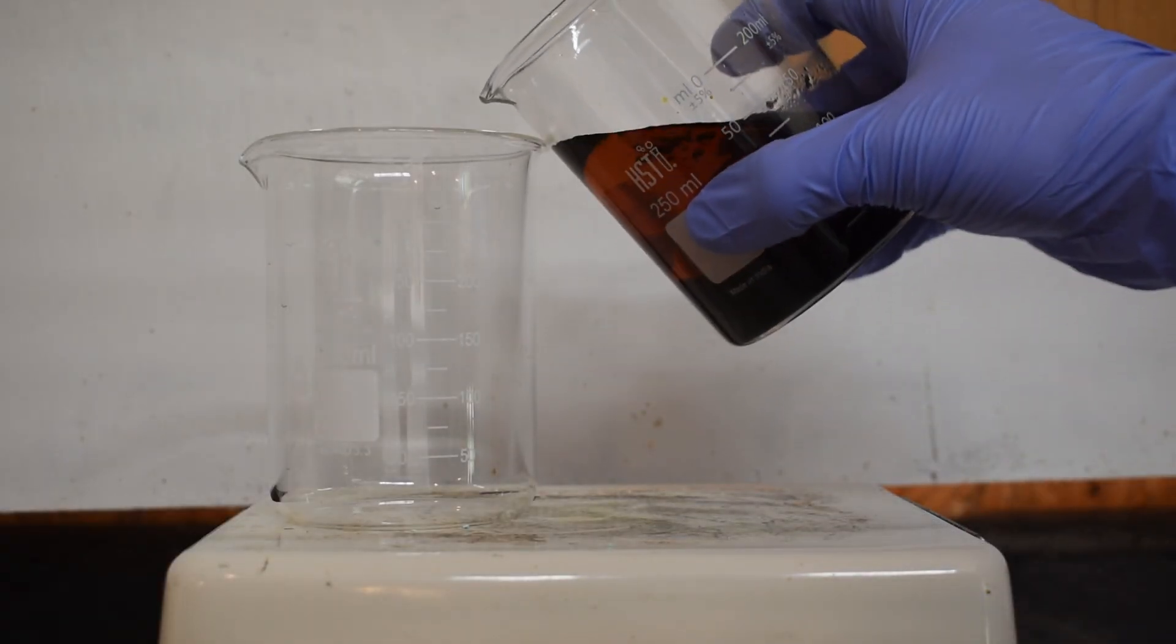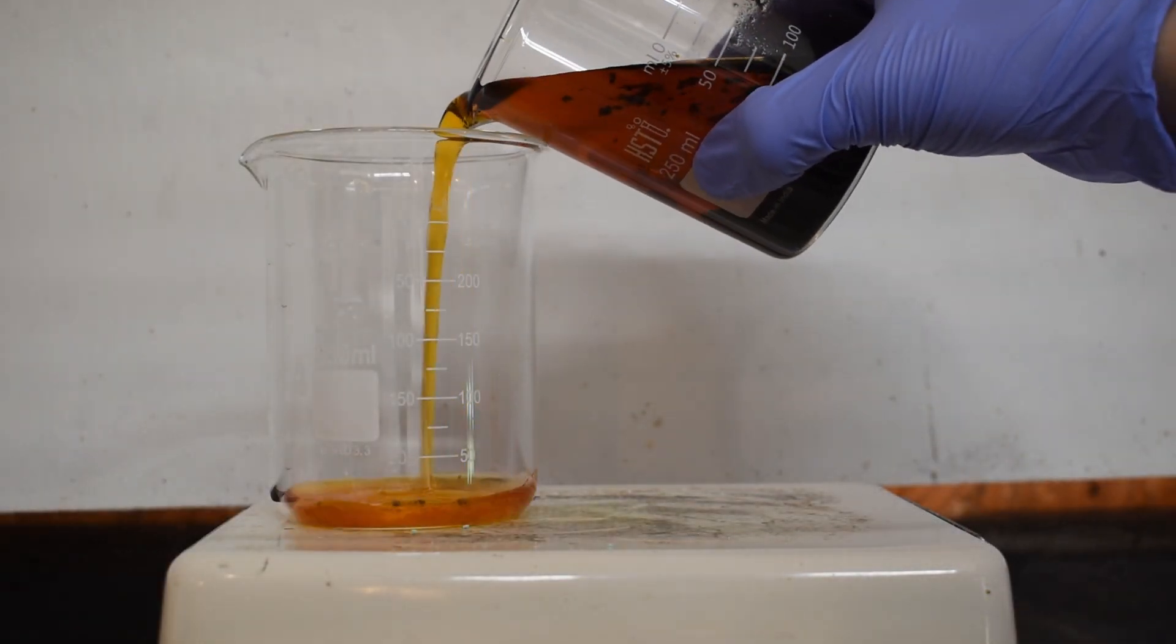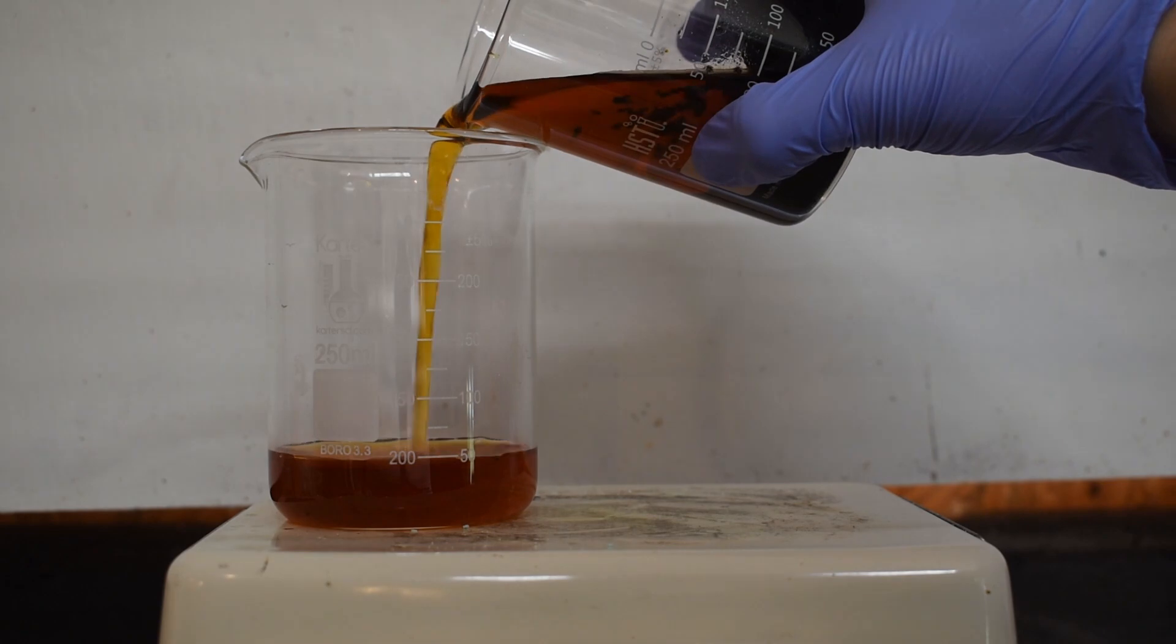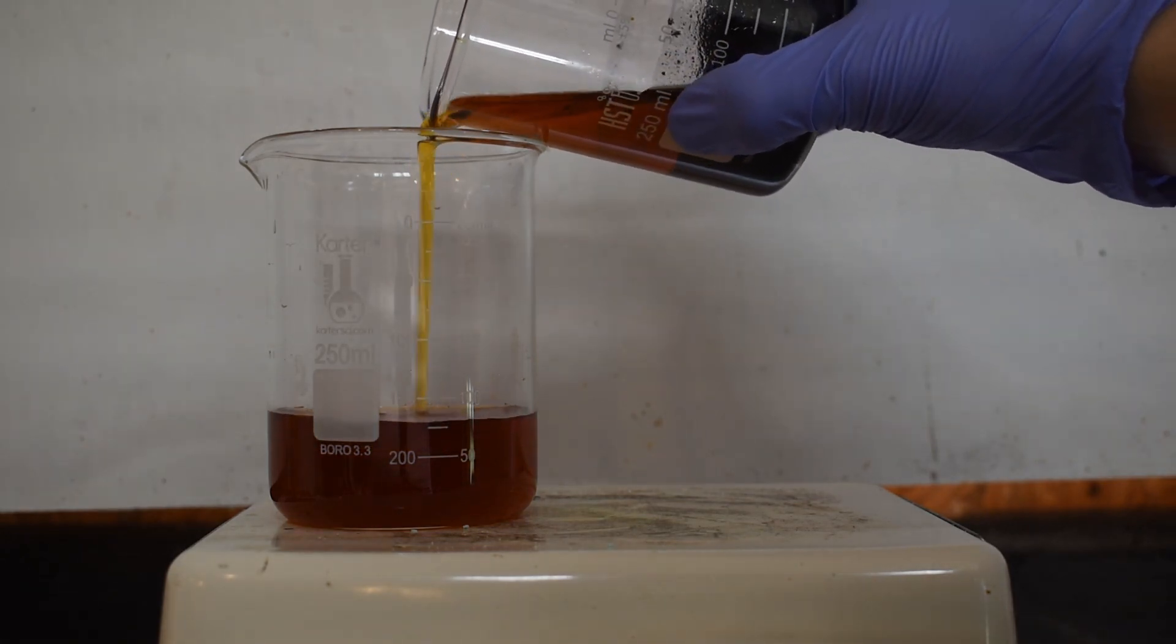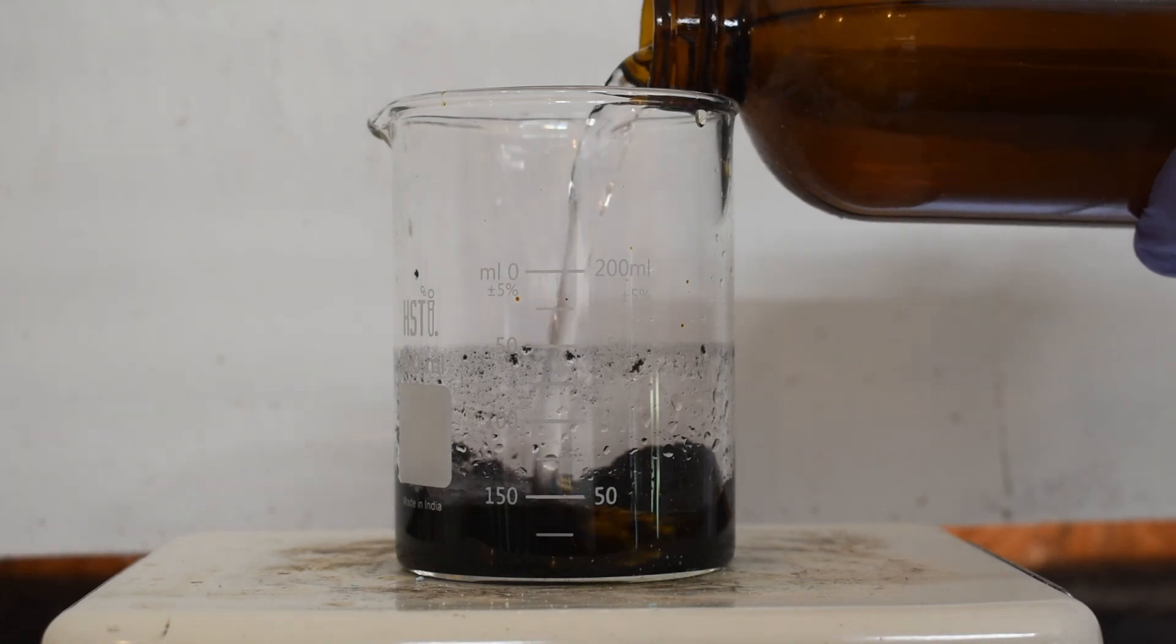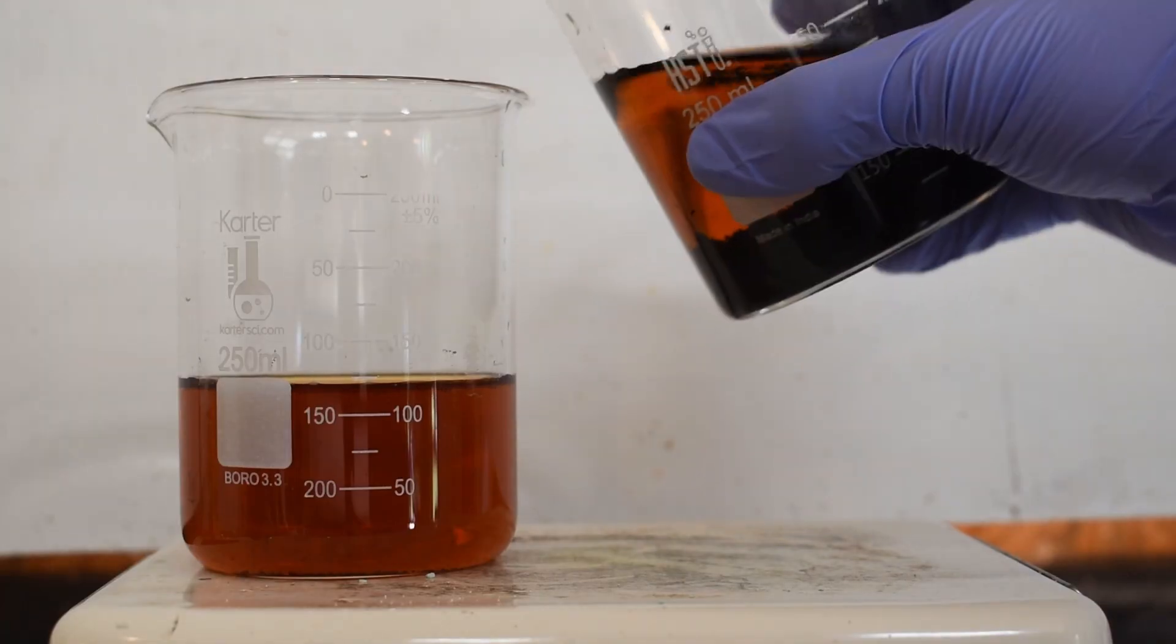I then poured the top layer of water off of the solid iodine that precipitated out and then I began rinsing it a few times with more water. This will help get rid of any hydrochloric acid or hydroiodic acid left over as well as any hydrogen peroxide.